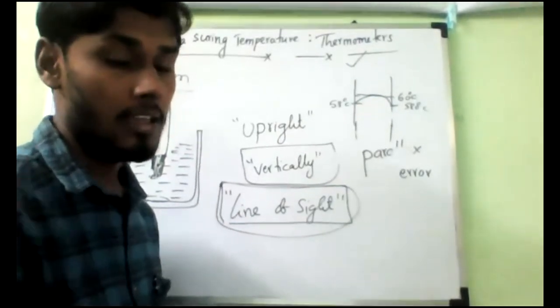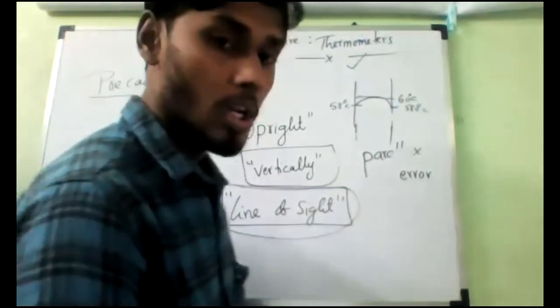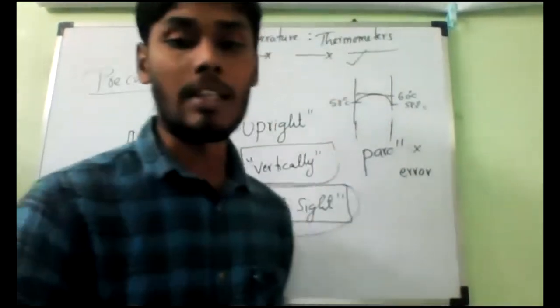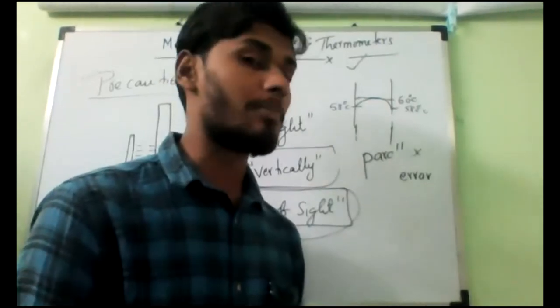And next thing, do not hold the thermometer by the bulb. Do not hold the thermometer by the bulb. What is the meaning of that? Can you say? Do not hold the thermometer by the bulb. Why?